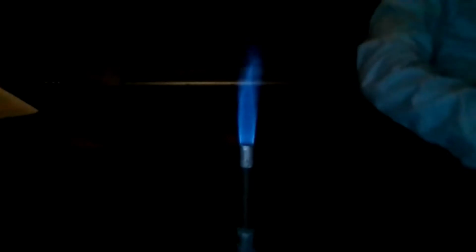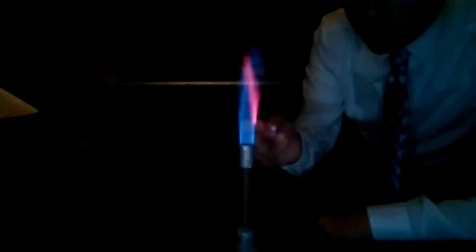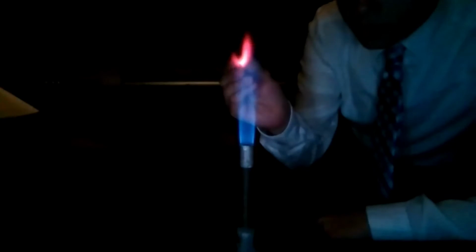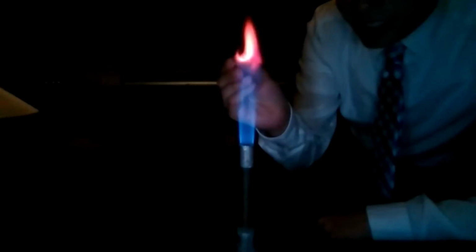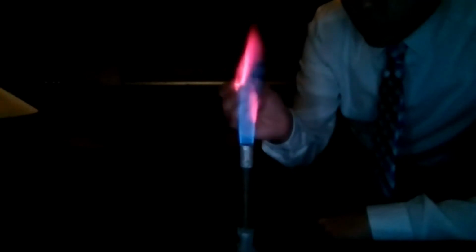Here we go. Good old lithium. Let's see. Ooh, that's a cool pink. It's that pink, magenta almost. Come on, give us some more. There we go. I don't know if you guys can hear that, but it's totally sizzling over here. Pretty cool, right?